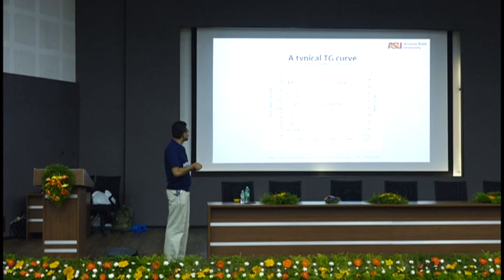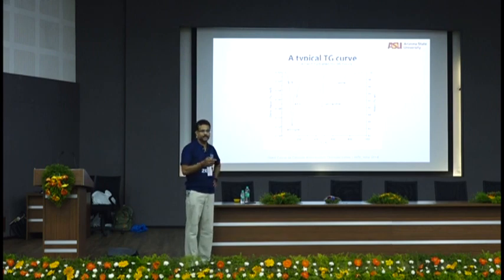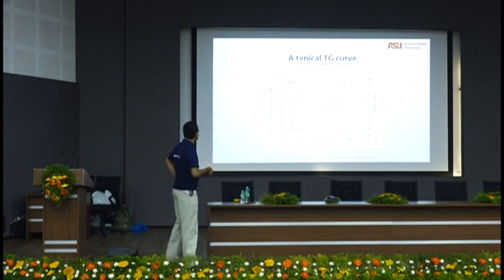So you get all these identifications, and then based on how much mass is lost in Portlandite, you start from here about 89 all the way to about 86. So 3% is lost. Then you look at the water stoichiometry and find out how much calcium carbonate and calcium hydroxide is there in the entire paste.